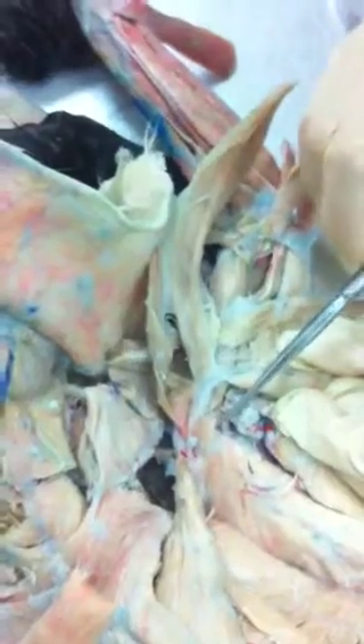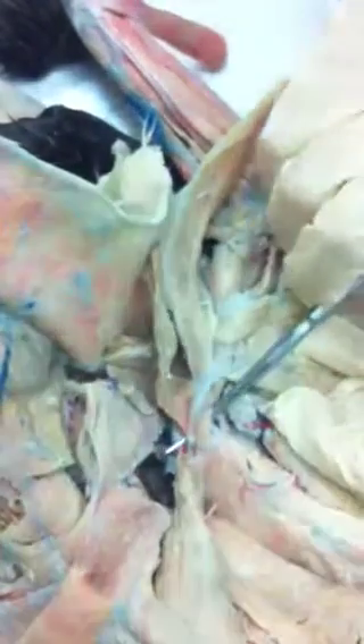And our coracobrachialis is really small. Right here is the biceps brachii where it originates, and right next to it is the coracobrachialis.